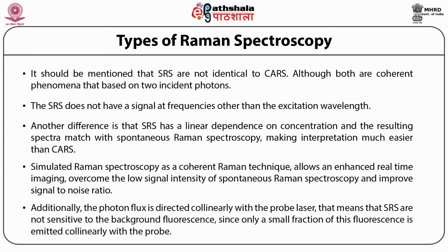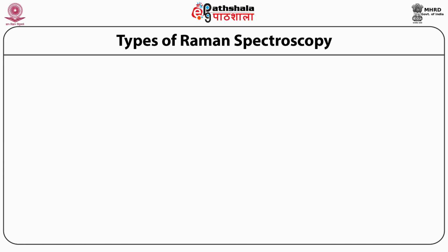Additionally, the photon flux is directed collinearly with the probe laser. That means that SRS is not sensitive to the background fluorescence, since only a small fraction of this fluorescence is emitted collinearly with the probe.